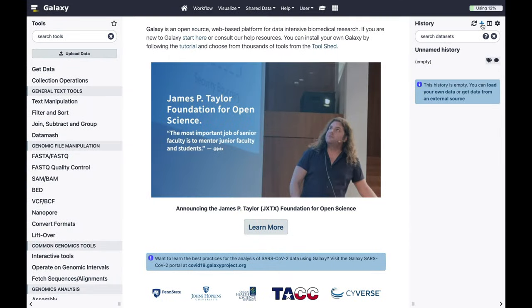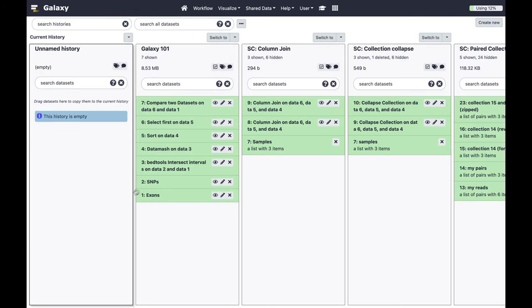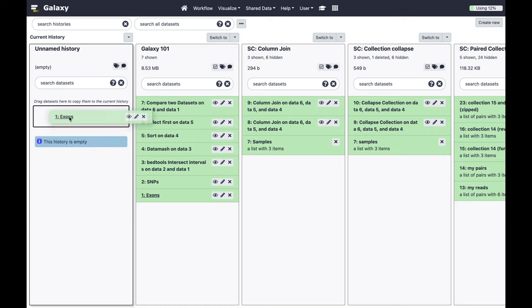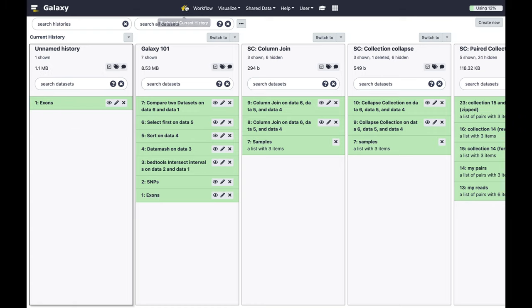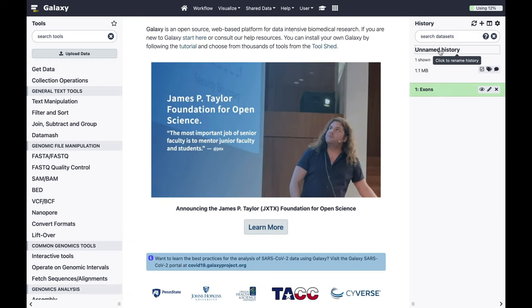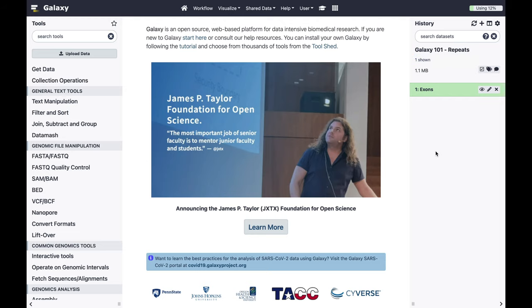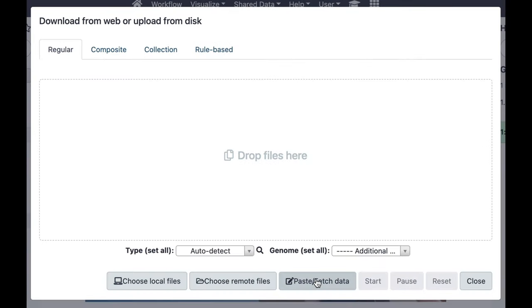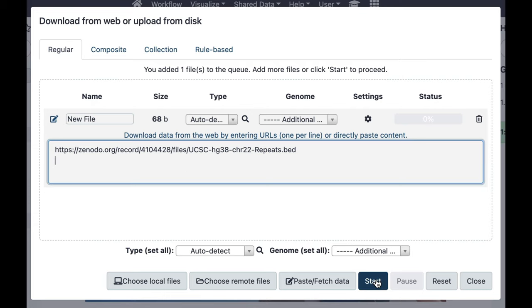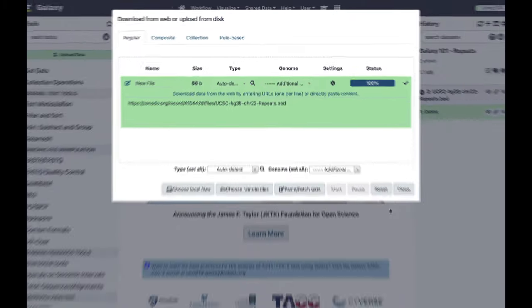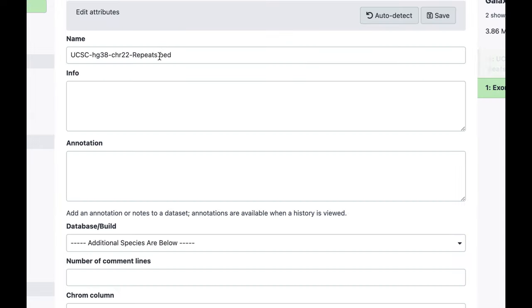This is a new empty history. I can go to the multi-history view and copy the exons dataset by dragging it over. Going back to the analysis view, I'll name this history — we're going to use repeats as the other set of genomic features. Let's upload the repeat information by pasting the URL from your tutorial and give it a more descriptive name.